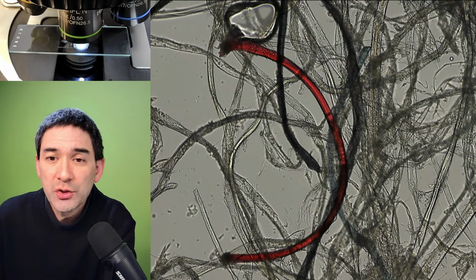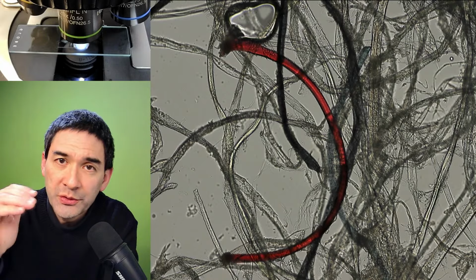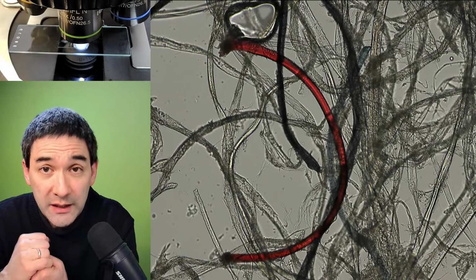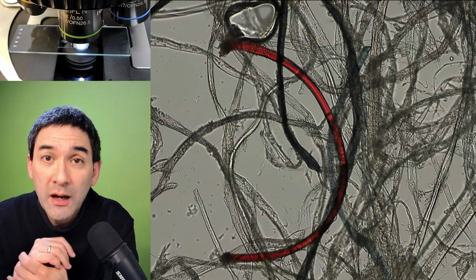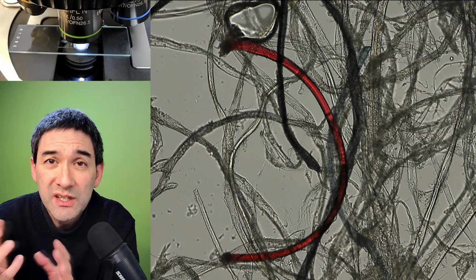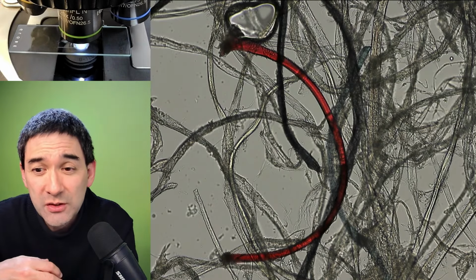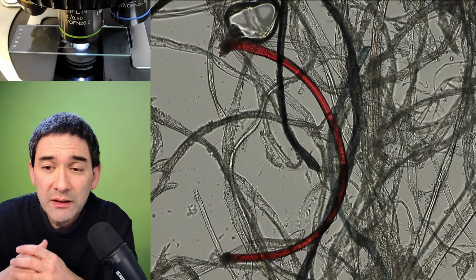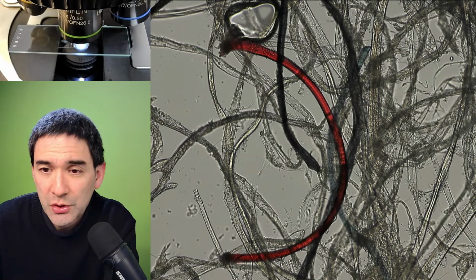And indeed, there are certain eyepiece cameras which you can insert into the microscope instead of an eyepiece. So you do not need a microscope with a photo tube, even though that's way more convenient. It is possible to get those eyepiece cameras and then connect them directly over USB. However, you have to be aware that you will not always get a very smooth image at high resolution. The reason being that the USB connection sometimes is too slow. So there is nothing perfect. I've been using microscope cameras also for quite a long time.